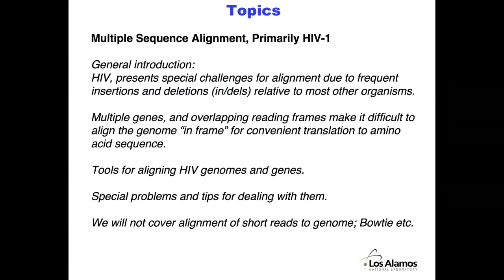HIV is a particular challenge because it has more insertions and deletions than most other organisms have. I mean, I've aligned lots of other proteins and genes over the years, and HIV really has some real tricks in it.